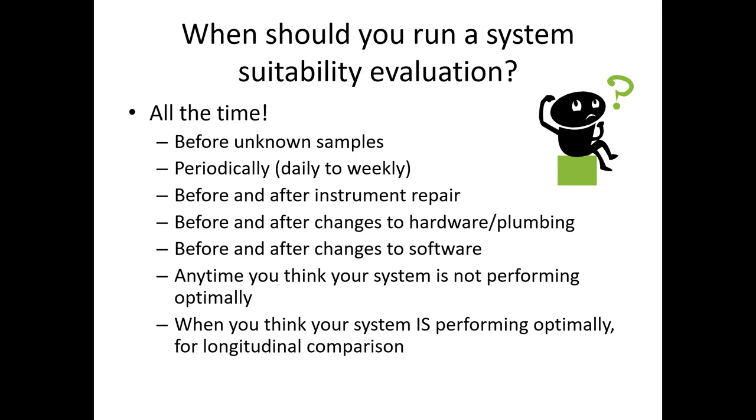When should you run a system suitability evaluation? Pretty much anytime you don't want to lose data, you want to run it before and after. But you're not going to bracket every single sample with a before and after because that decreases your throughput. So what's good to do is to set up a system suitability method if you don't have one, and then get a baseline of your instrument's performance.